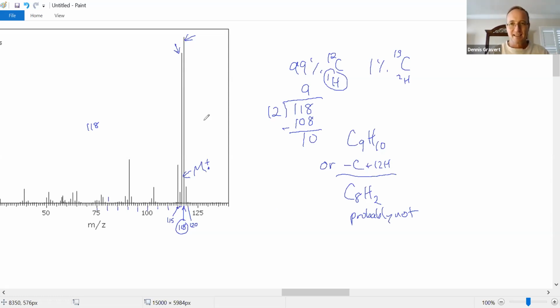But this is real data. So where did you get this real data? Well, from real molecules that exist. Things are stable and cheap and easy to find. So this is going to be a very unstable molecule with a lot of rings, a lot of pi bonds. It's going to be expensive, or maybe it just doesn't exist. No one's made it yet. It's going to be pretty rare. It's not going to be something I can go find and give to you as a homework or an exam question. These are going to be common molecules or very stable molecules. So when you start seeing chemical formulas that are weird, be suspicious. I probably won't spend my time thinking about molecules with this weird chemical formula. This one looks more realistic.